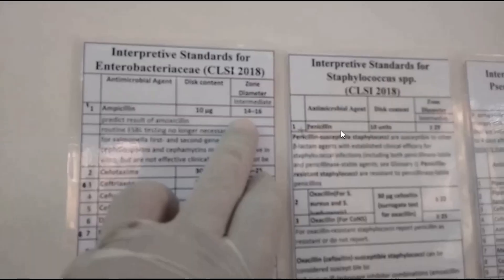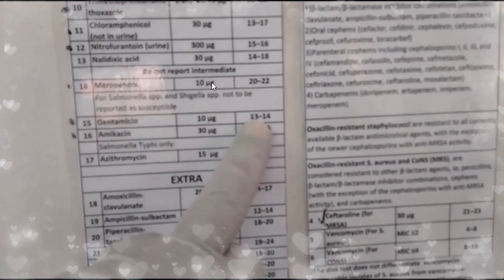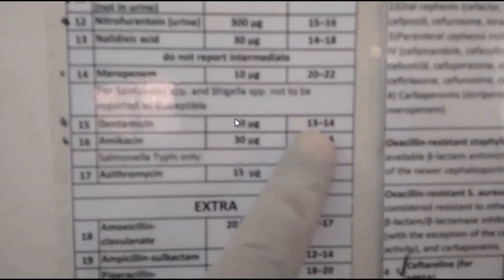Now compare this reading according to CLSI standard chart for antimicrobial sensitivity test.